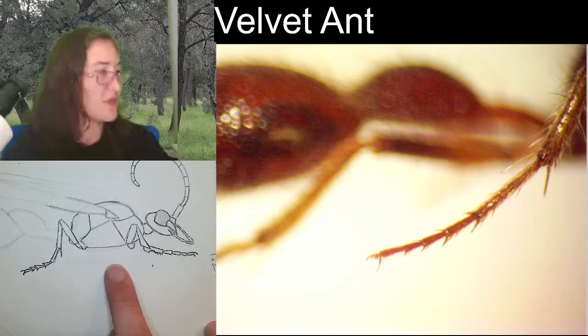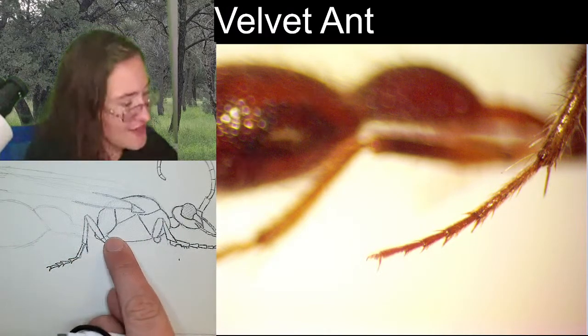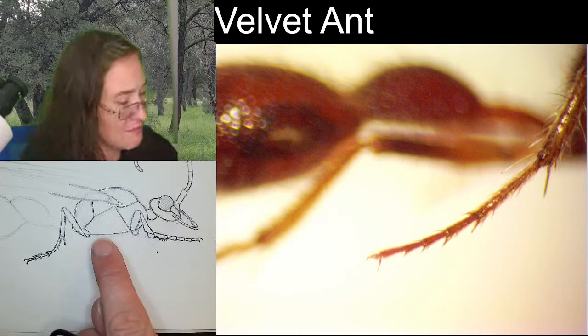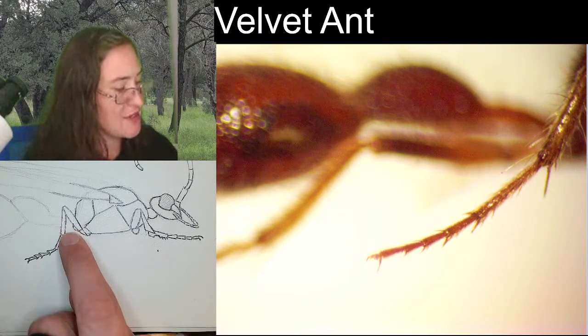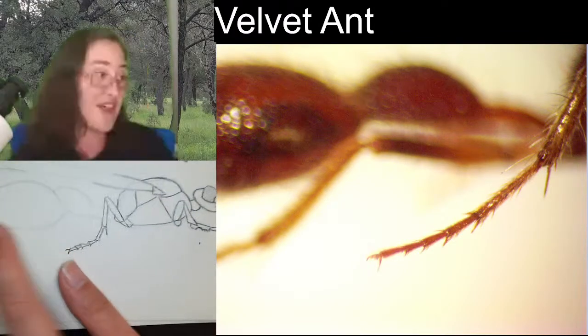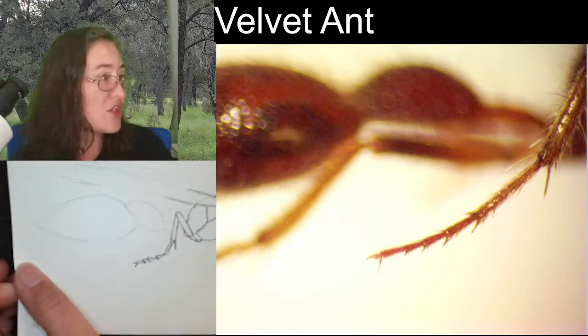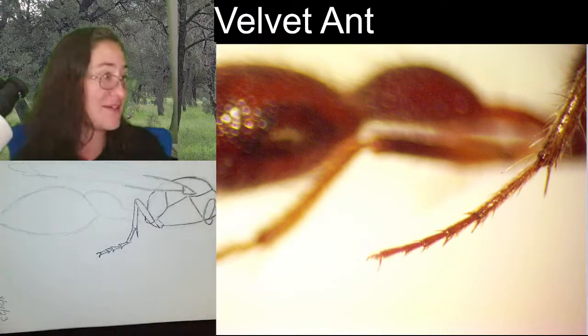Alrighty, so that is front leg, middle leg, most of the thorax, and most people might think, hey, where's the other pair of legs? Well, the next pair of legs is going to be connected way back here, and they have very long hind legs. So those hind legs are actually going to go long enough that they go past the end of our abdomen. So that's going to be fun.